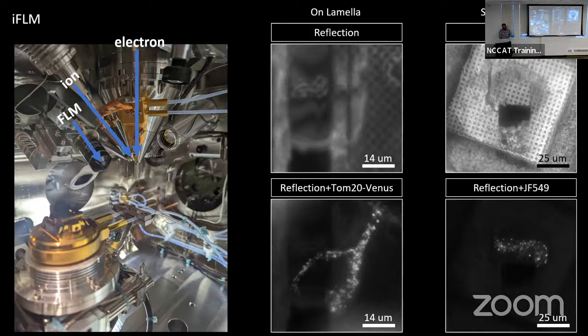These images are kind of like SEM angle, so it's like 90 degrees to the surface. But with Meteor, you can actually get milling angle images. So you don't have to do 3D transformations, and you know exactly where to mill, which is super useful.